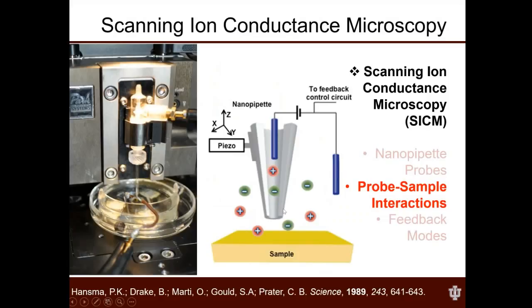So that's the probe for SICM. It's relatively straightforward. What might not be as straightforward is the probe-substrate interaction and how that's used to generate the feedback mechanism for SICM.